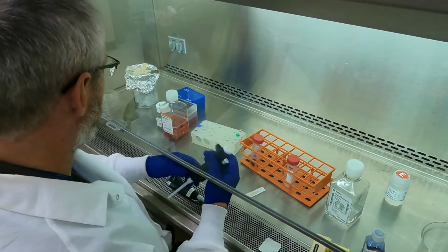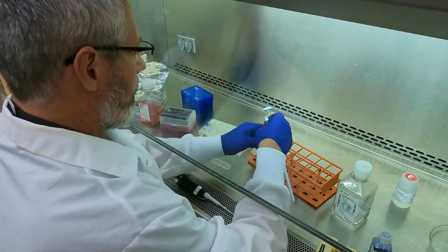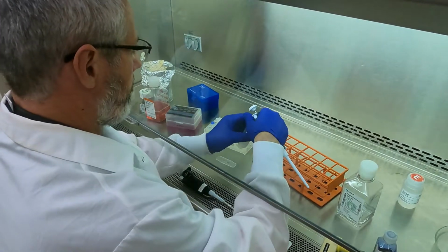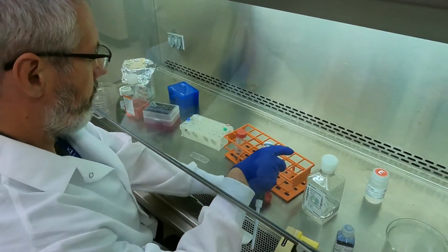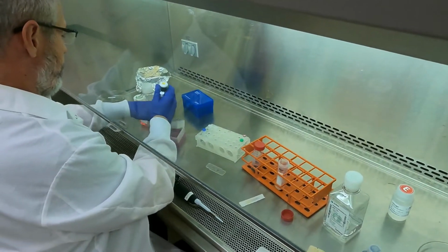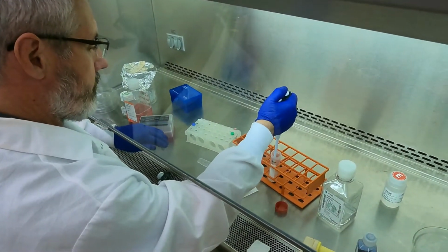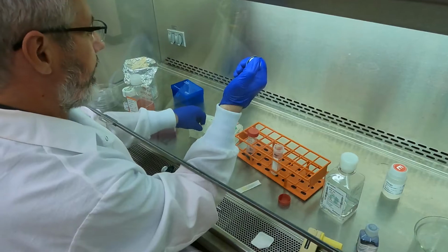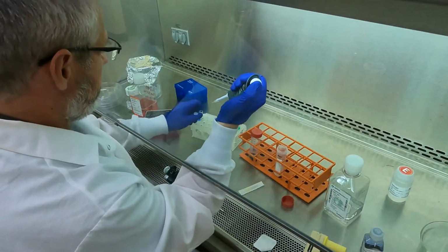You can get nice accurate 100 microliters. So again, give these guys a little mix. And then I want to go in and get 100 microliters as well, without touching the sides if we can. Like that. So that's good.